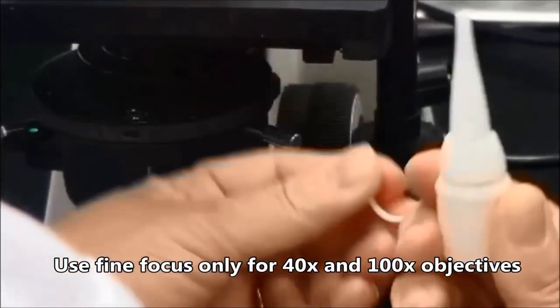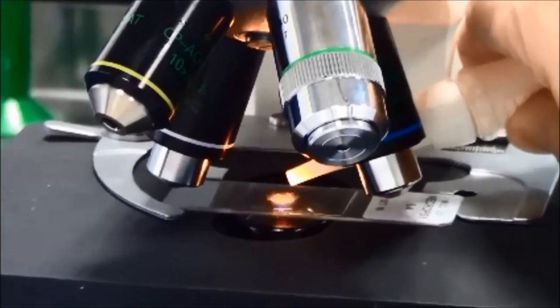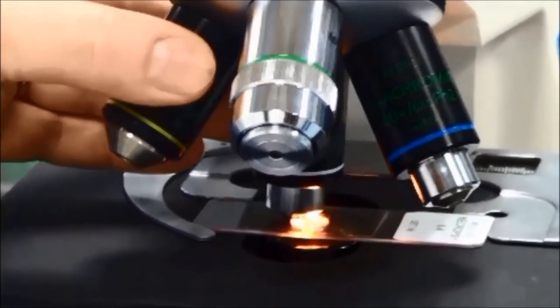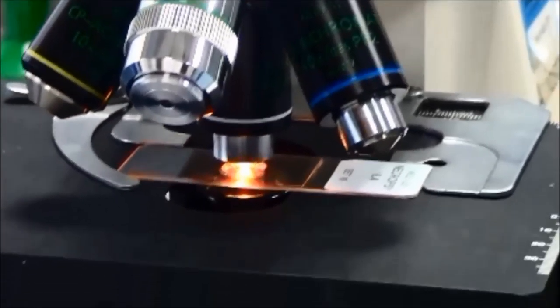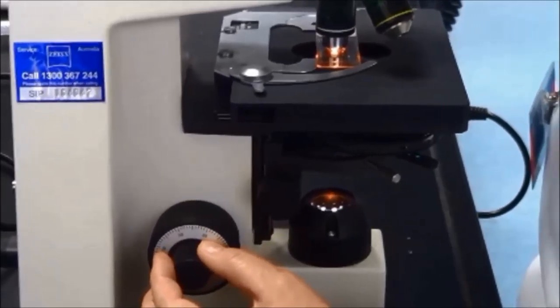To use the 100x lens, swivel the turret so the slide is between the 40x and 100x objective lenses. Place a drop of immersion oil on the circle of light on the slide and swivel the 100x lens into position so it is in contact with the oil. Refocus using the fine focus only.